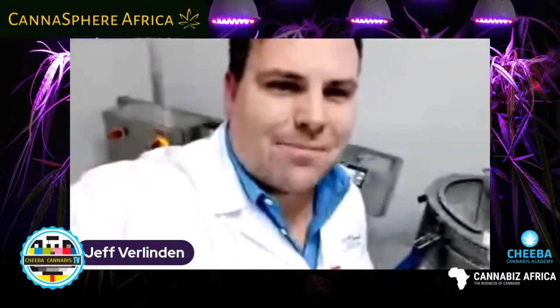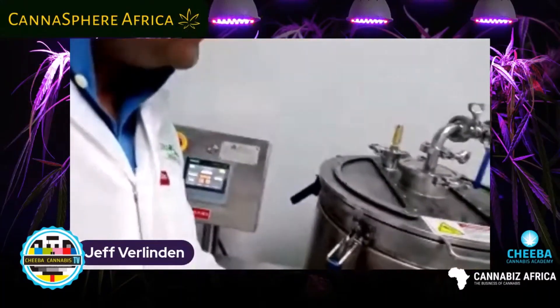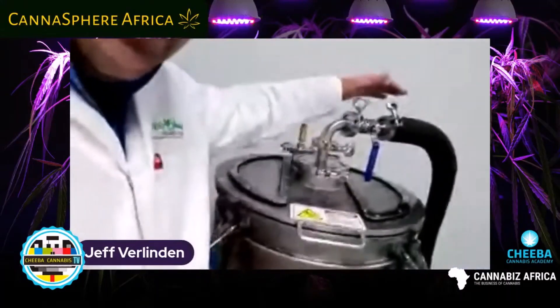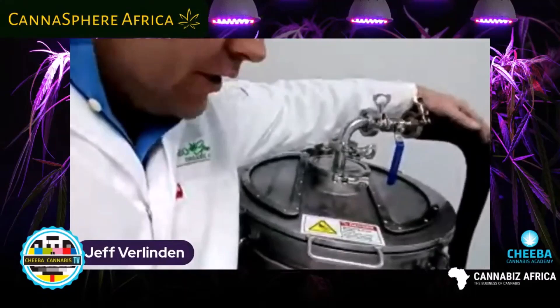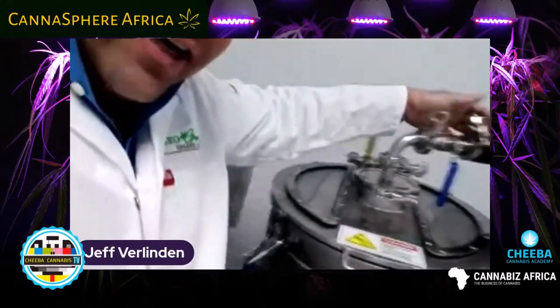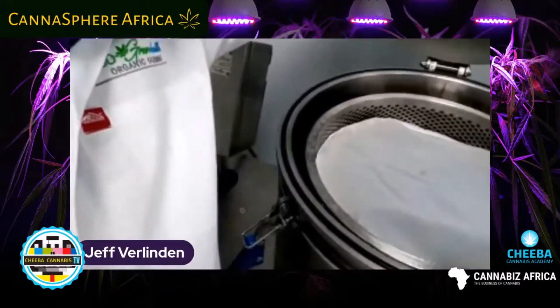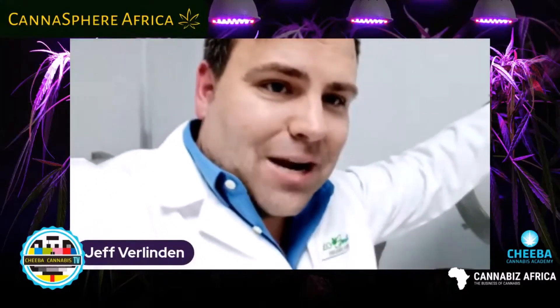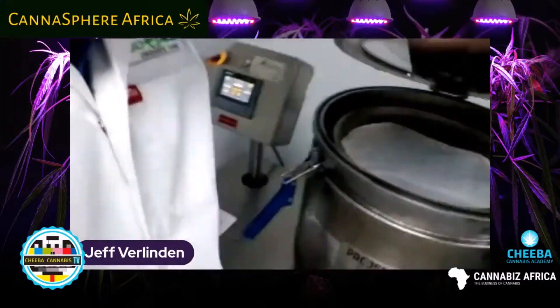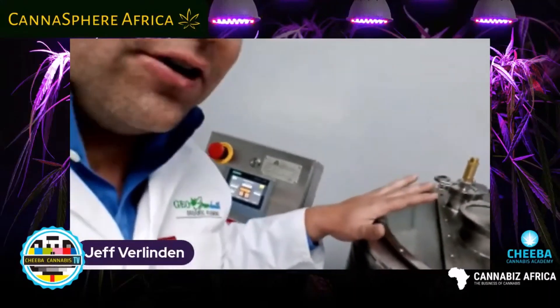Hi guys. So today I'm at GeoGreen Health, and essentially what we're going to be talking about is chilled ethanol extraction. This is some equipment that you'll find in the lab. To efficiently facilitate commercial extraction, you'll have negative 40 degrees Celsius ethanol that comes into the system. Inside, you'll notice that we have an actual bag that's been packed with biomass — essentially cannabis, or hemp cannabis, for those who don't know. This will be submerged under cold conditions for about 10 minutes, depending on how you define the SOP.